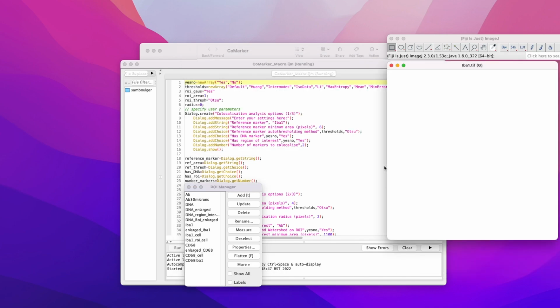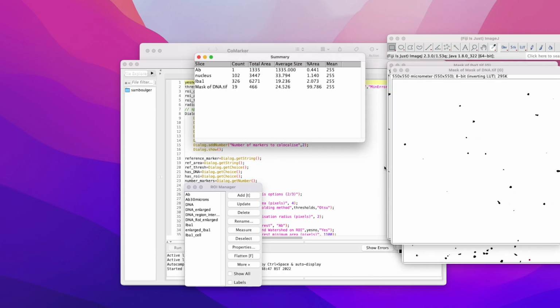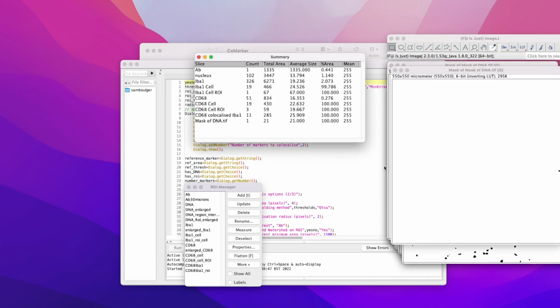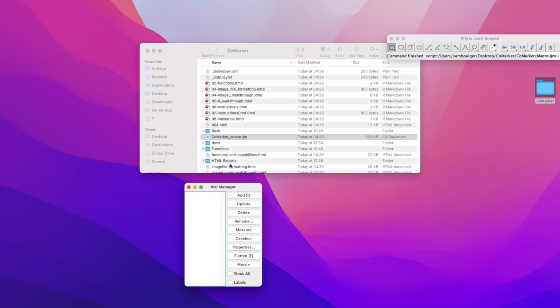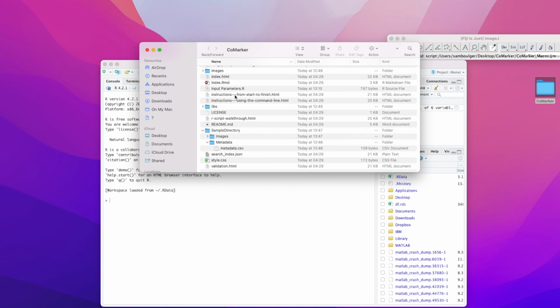The Gaussian and watershed function we have for the region of interest works great for our amyloid beta regions of interest, but not necessarily for others. So definitely worth testing it out, test out different thresholding methods and test out minimum sizes. So now this stage of the analysis is done, we can close Fiji ImageJ and open R.